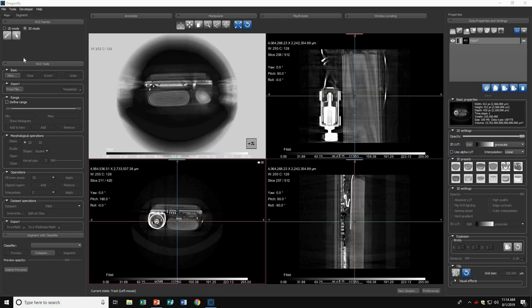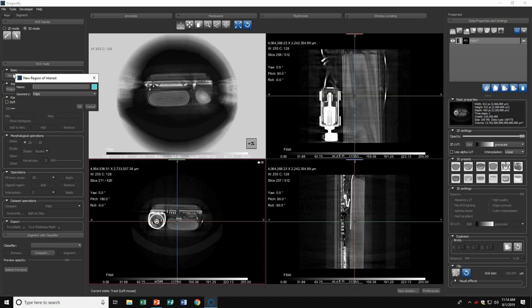Region of interest is useful for highlighting a specific region of your 3D image. To begin, click New to create a new region of interest. Today I want to highlight a section of my battery, so I'll make that the name.